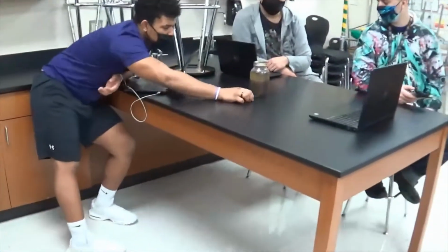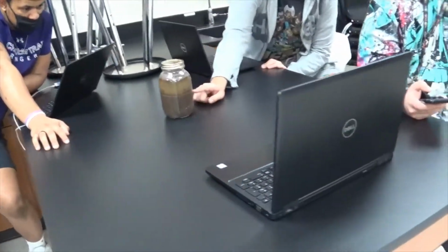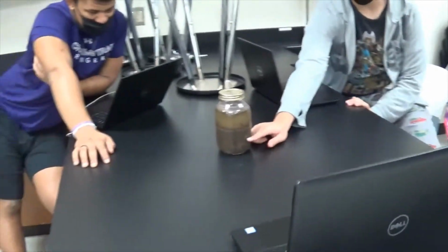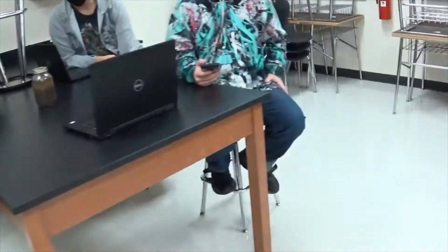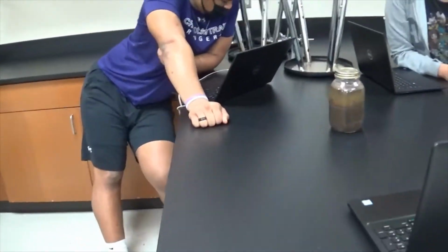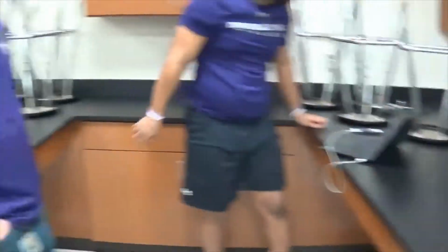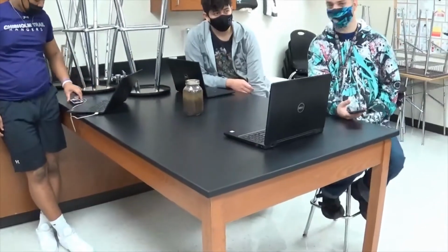There's a split at the bottom of something and something. I don't know what it is. Okay, so we have a separation of the soil itself into layers. So what do you think that bottom layer might be? I feel like that's sand. Ken, why do you say sand? I don't know, looks like sand.